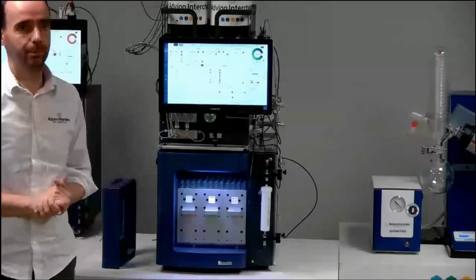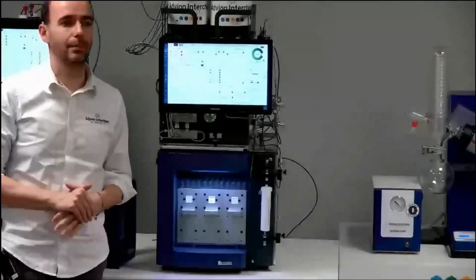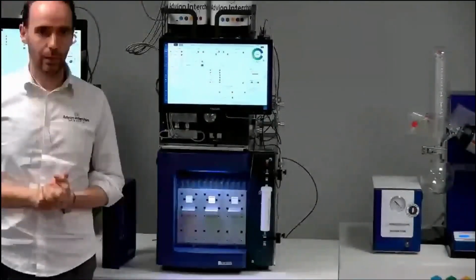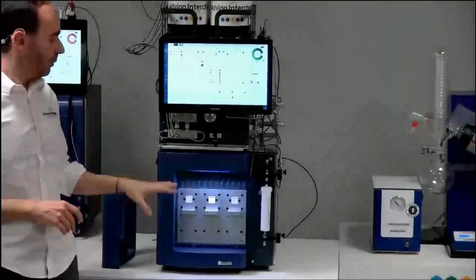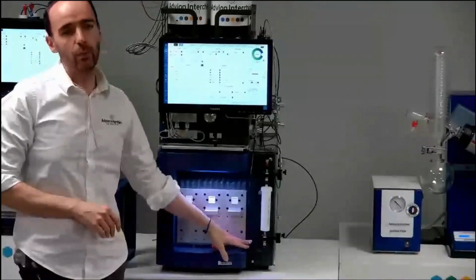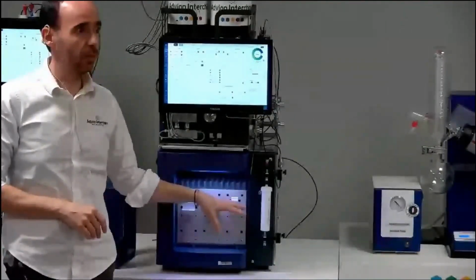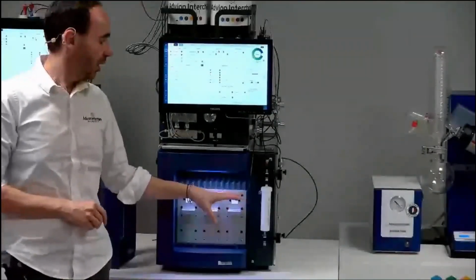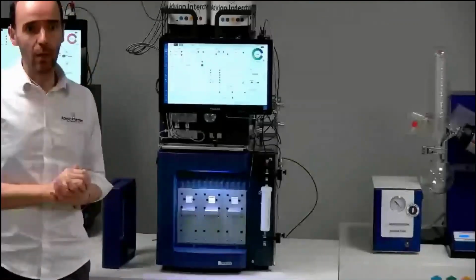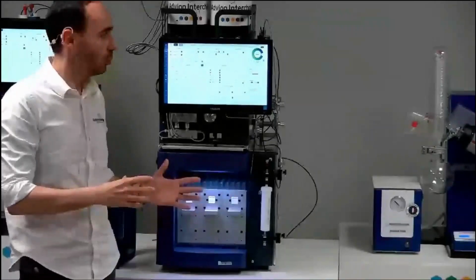This question says, what are the largest size Flash and Preparative columns that can be used on the system? So on the system itself, in column holder number 1, you can put a column with ID up to 50 millimeter, and on the side 30 millimeter. But you can also use an external column holder if you want to use a bigger column.